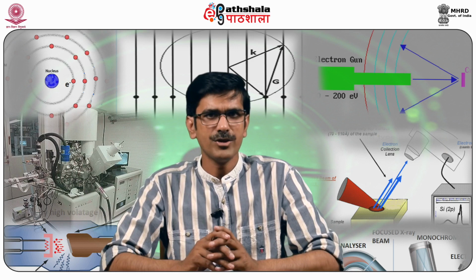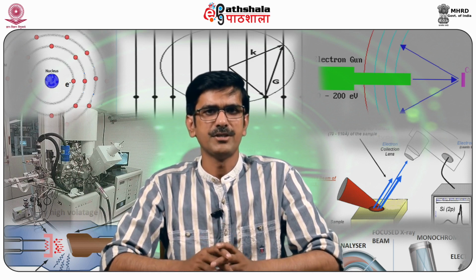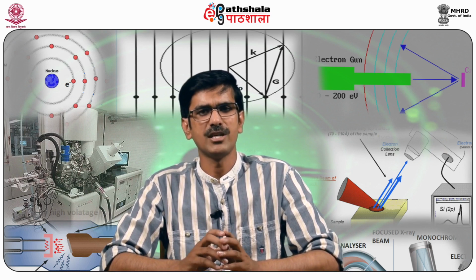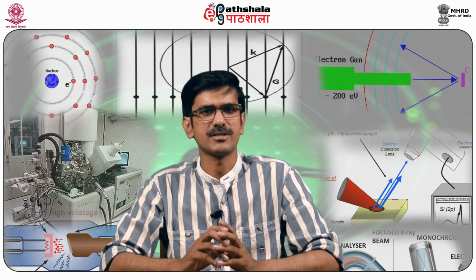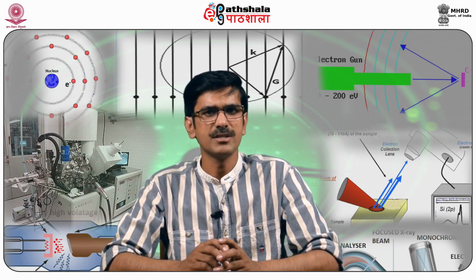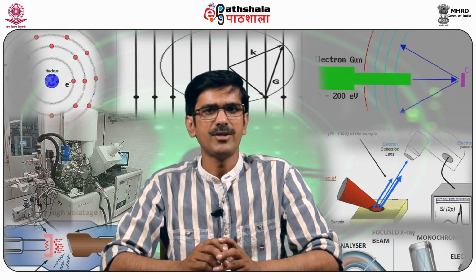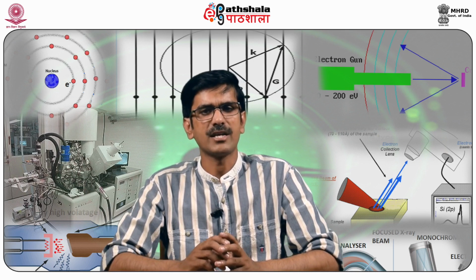Elements with atomic number from beryllium to uranium can be detected. The detection limit varies depending on the element and the sample matrix. If there are a large number of elements, the peaks obtained are overlapping and they are identified depending on their peaks in the different X-ray families.